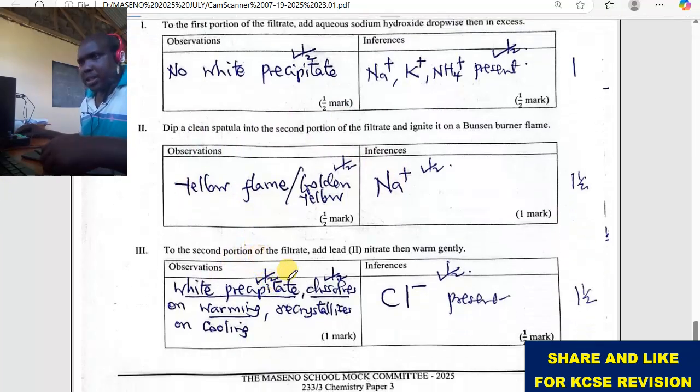To the second portion of the filtrate, add lead 2 nitrate, then a white precipitate forms, and then warm gently. That is where we want to concentrate. If you are adding lead, remember all chlorides are soluble except lead chloride and silver chloride. But lead chloride is soluble in warm water. So when we warm, we dissolve that white precipitate. So the white precipitate dissolves on warming. Then it means the chloride ions are present. That is very okay.